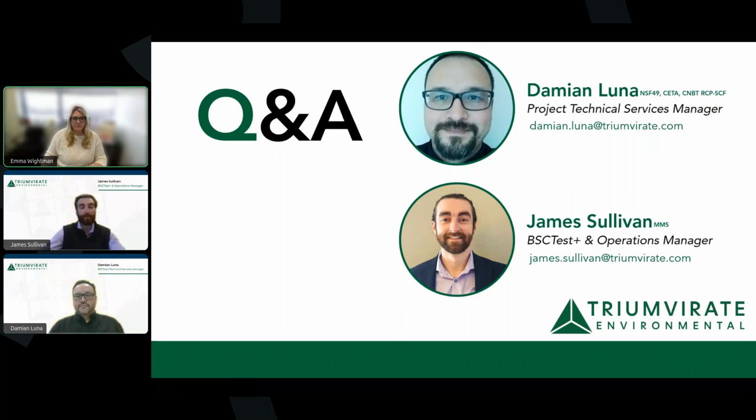Yeah, no problem. So this is our bread and butter. This is honestly what I like to do. I love to work with my clients and find that best solution. Generally it really depends. It's nuanced. I'm sure you guys are going to get sick of hearing nuanced answers, but let's say you just need 2 biosafety cabinets decontaminated. I can send you out a risk assessment form. If it's standard biologics, it should be pretty straightforward.